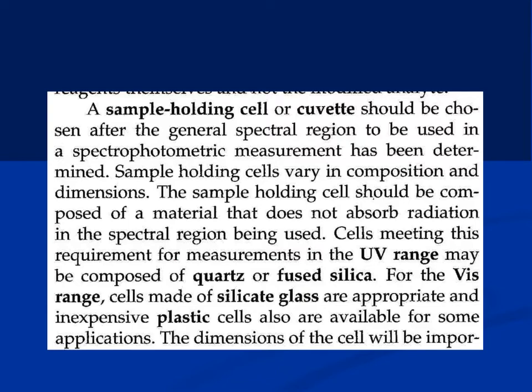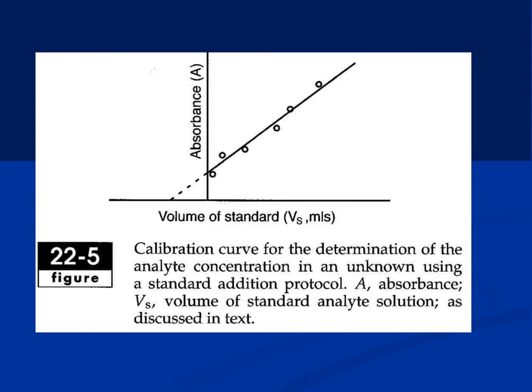Also, I told you that the path length is fixed at 1 centimeter, and that's what we use in all our calculations. It basically makes it simpler. You just substitute 1 for the path length parameter, and that makes the calculations simple.